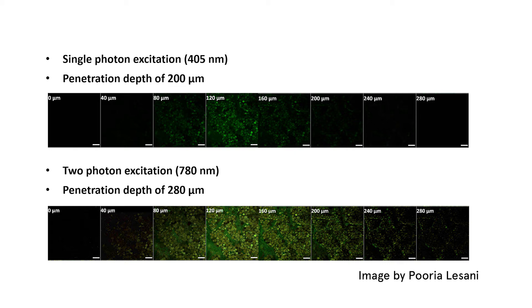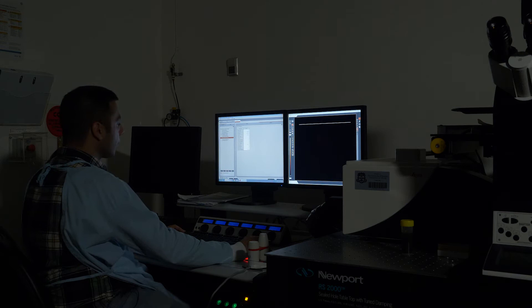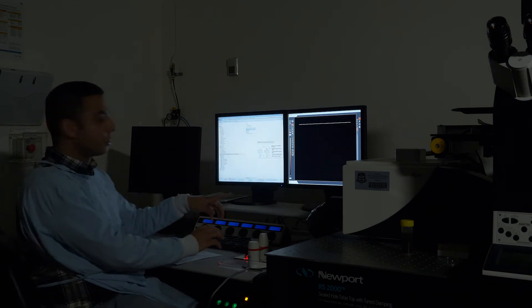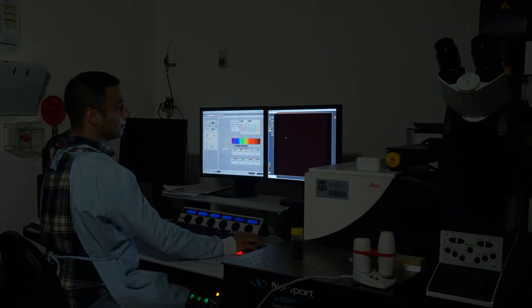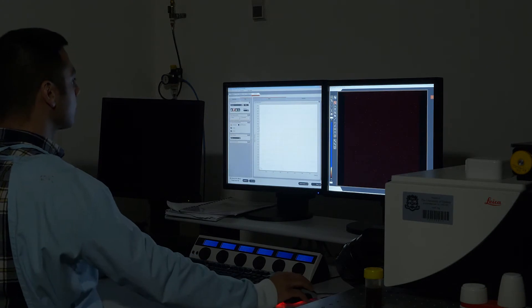Oh, we got a little bit off track — we wanted to see the synthesized carbon quantum dots' optical properties under the microscope. We have our sample on the microscope. First, we want to find which excitation wavelength to use, so to find the best two-photon excitation wavelength, we will run a photoluminescence excitation scan on the microscope, which will give us the best excitation wavelength.